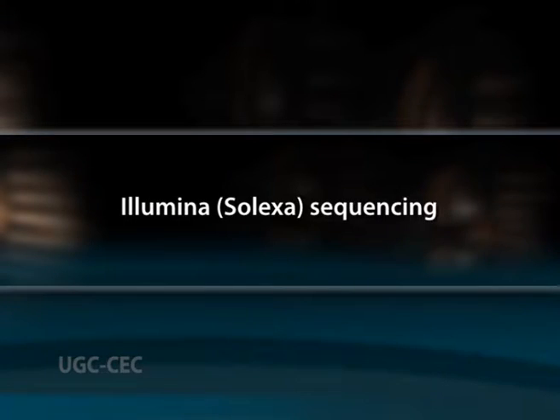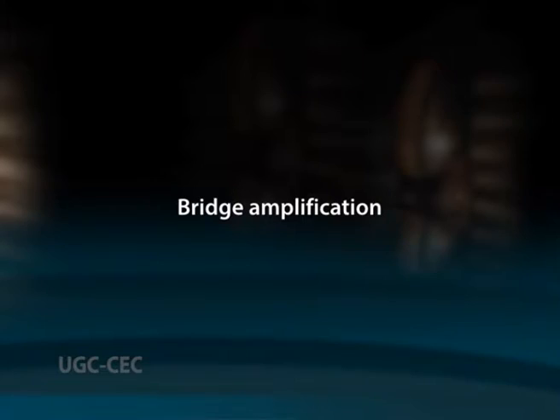The next one is Illumina or Solexa sequencing. This is a sequencing technology developed by Solexa based on Dye-terminators. In this, DNA molecules are first attached to primers on a slide and amplified. This is known as bridge amplification. Unlike pyrosequencing, the DNA can be extended only one nucleotide at a time. The images of the fluorescently labeled nucleotides are taken by a camera, then the dye along with the terminal 3' blocker is chemically removed from the DNA, allowing the next cycle.